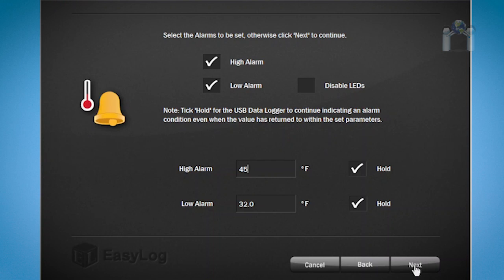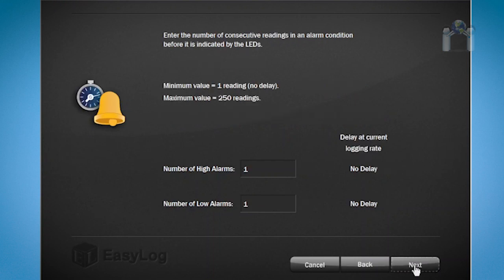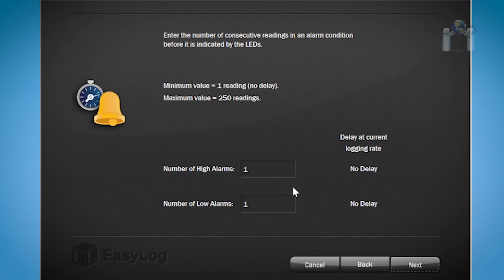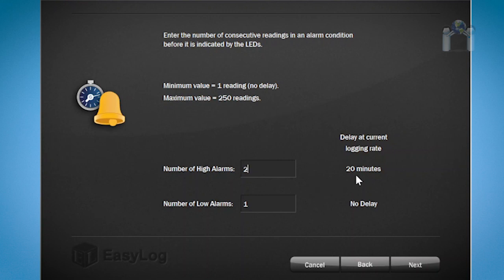Click Next and you can configure the number of consecutive readings before the LEDs indicate an alarm condition. The time is determined by the time between readings and the number of readings you choose. Since I have configured each reading to be 10 minutes apart, the value of 2 means the data logger would have to be in an alarm condition for 20 minutes before the LED will report the alarm. I will keep the value at 1.